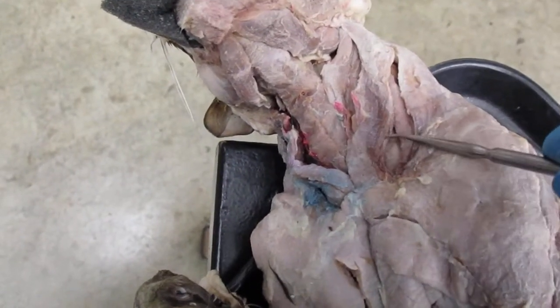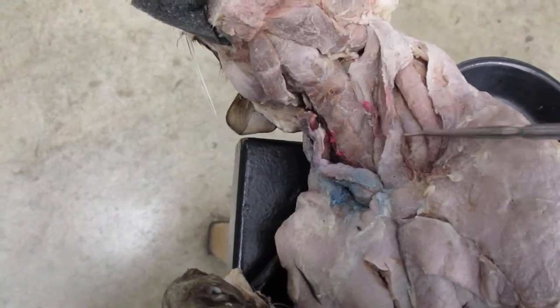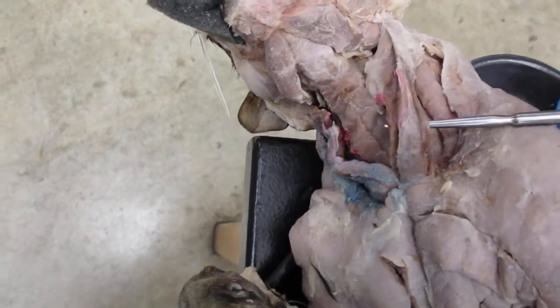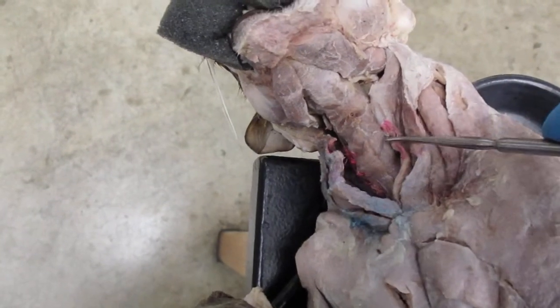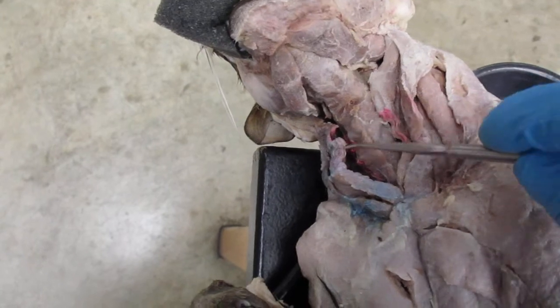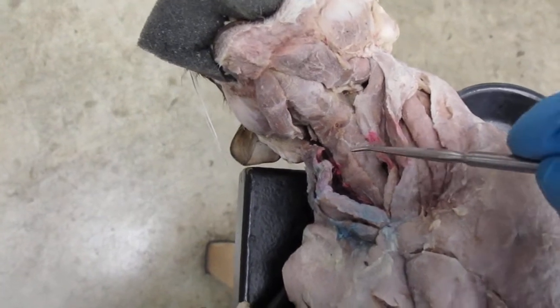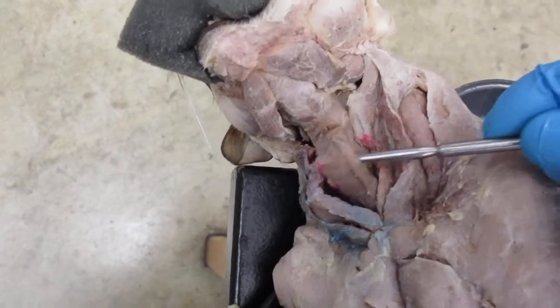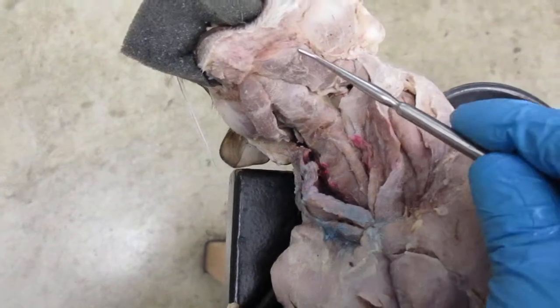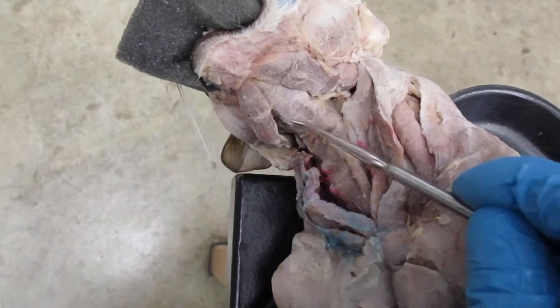And then we have the sternal-mastoid right here. Here's your sternal-mastoid muscle right there. And then same thing right here, sternal-mastoid. And then I did a butcher job and destroyed the sternal-hyoid. Right here you can see the sternothyroid really good. The sternothyroid is shown really good right there. So digastric muscles here and here, and then you have your mylohyoid.